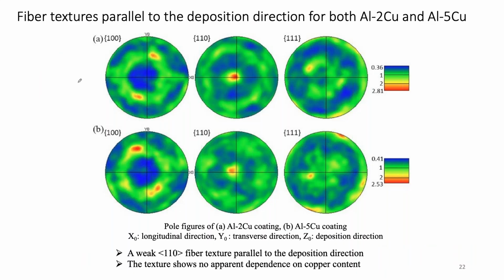Okay. We've also seen, and there's really not many results on this in the literature, some evidence for the development of deformation textures from EBSD. Now, to be fair, you could do this in X-ray diffraction or neutron diffraction, and maybe we should. I think those would be better techniques because they're going to average over a whole lot more orientations.